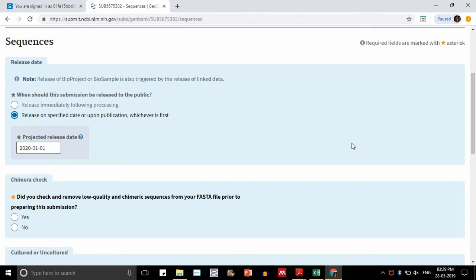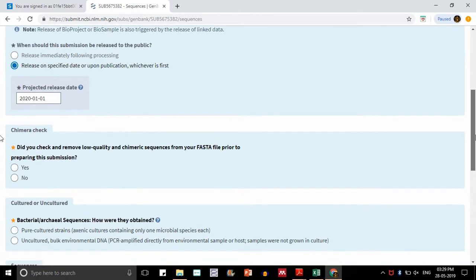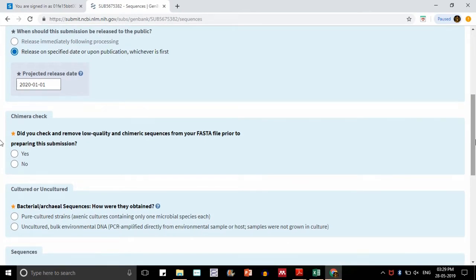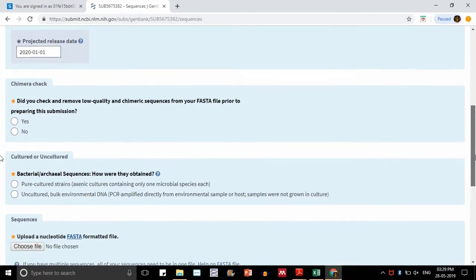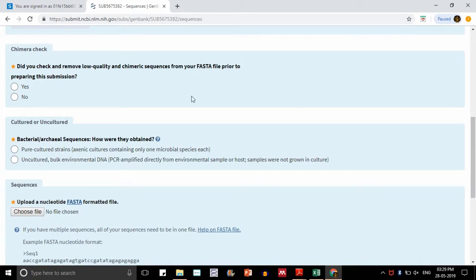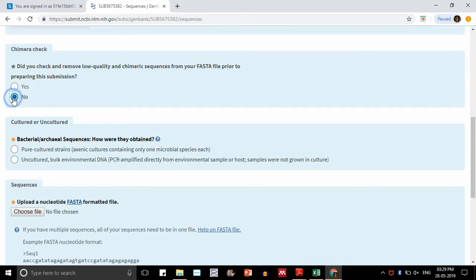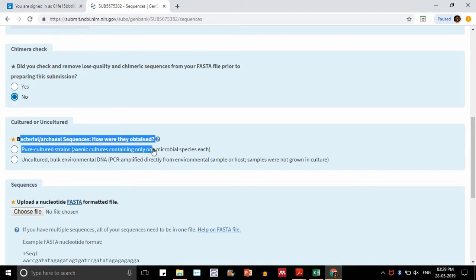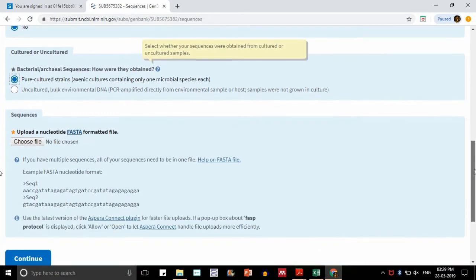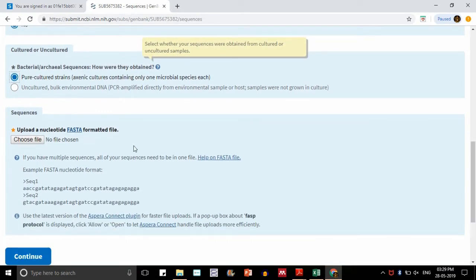Chimeric check. It is asking whether we have checked and removed low quality chimeric sequences from the FASTA file. We have not done that, so obviously no. It was asking whether the bacteria was cultured or not. It is a required field, so I am saying it is pure, because our culture was pure.